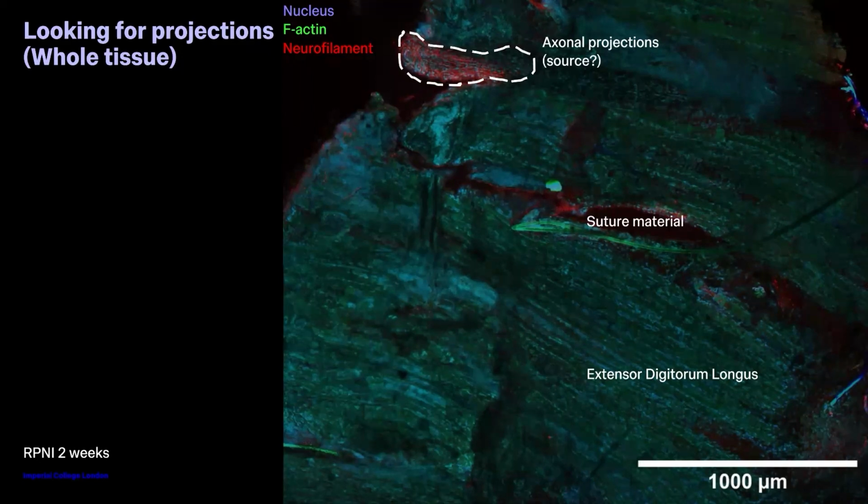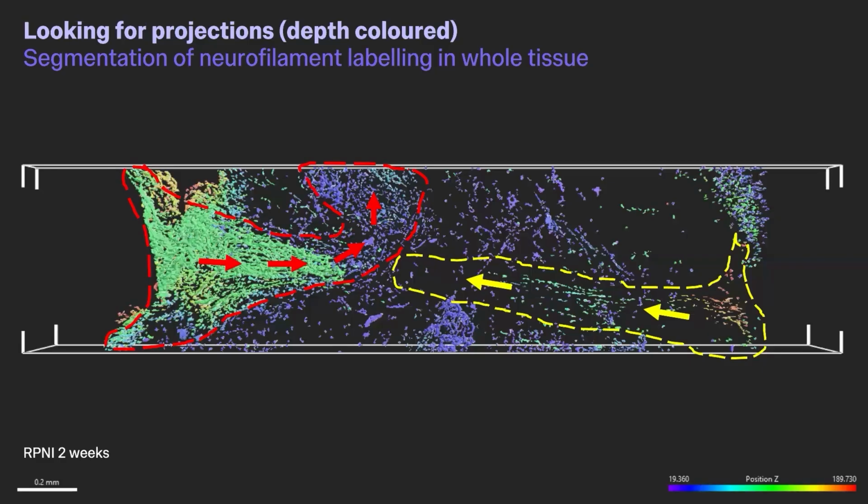And then you can also look at a little bit of volume measurement in these tissue samples up to about, let's say, 500, 600 microns, depending on the optical clarity of your tissue and the strength of the stain that you're interested in. It's not going to be the same as a dedicated piece of instrumentation for volume imaging, but it is a very good and easy first step, or at least we found it to be.